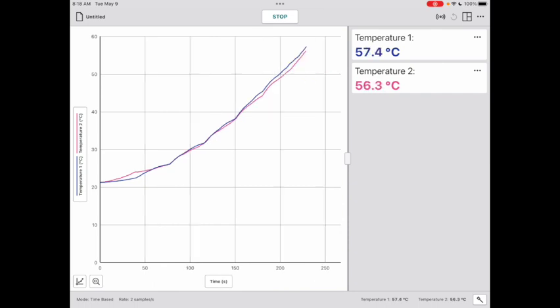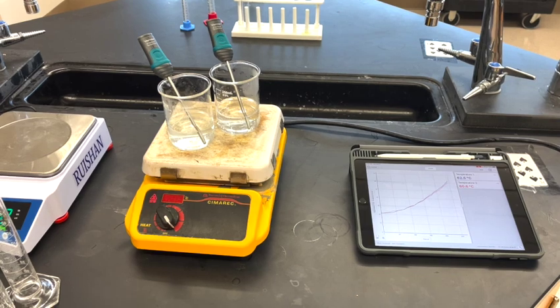Let's check in on the beakers here and see what's happening at 55 degrees Celsius. As you can see, not much is happening.